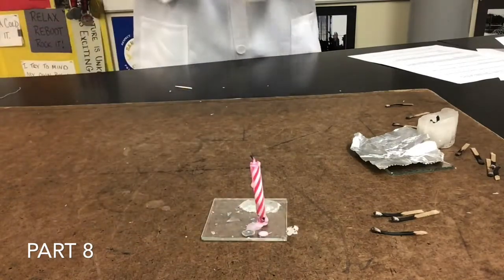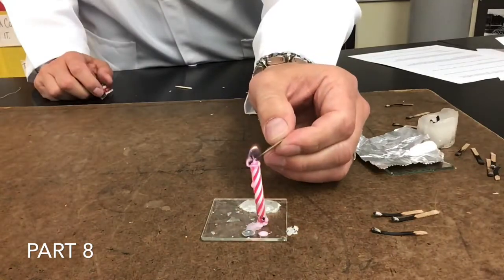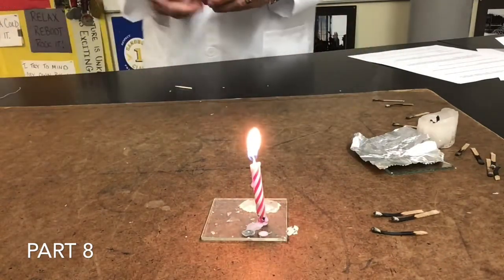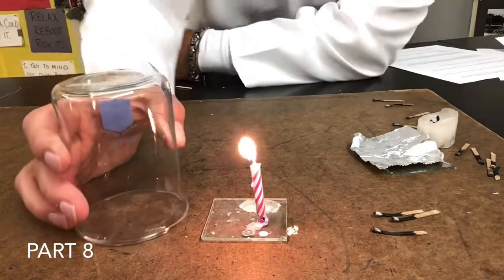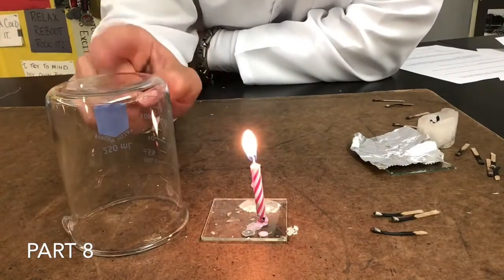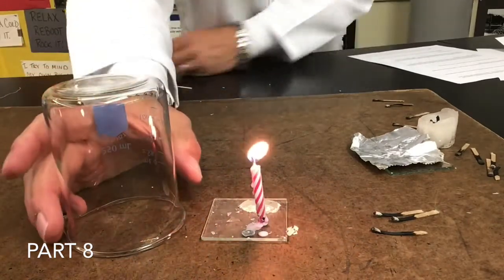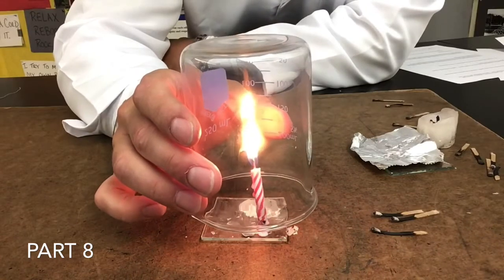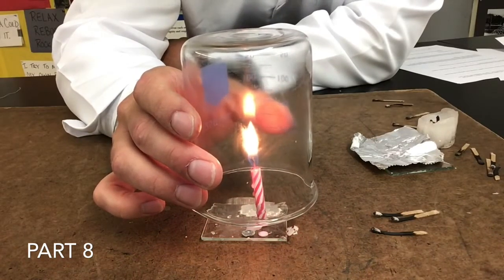I'm going to put this candle back on, so I'm going to light it up. And then we are going to get a beaker. Now the beaker is going to go over the candle, and we're gonna see what happened. Notice that the candle will not hit the top of the beaker. We're just going to put it over the top. So I'm gonna hold that beaker over the top. We'll see if there's anything we can observe.